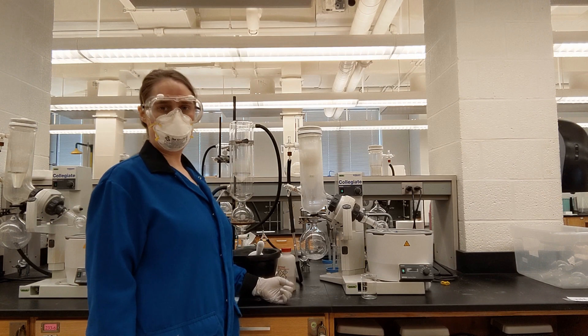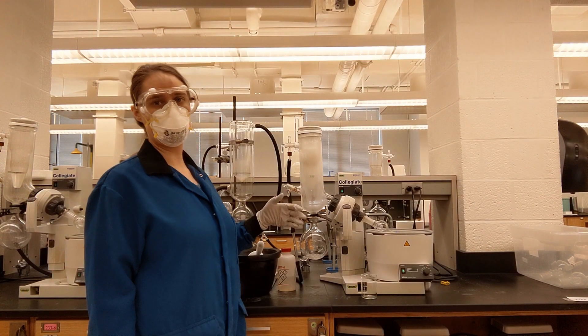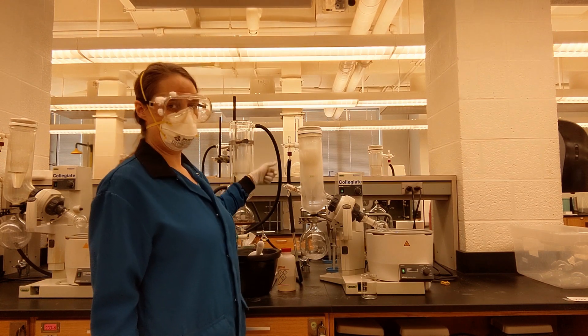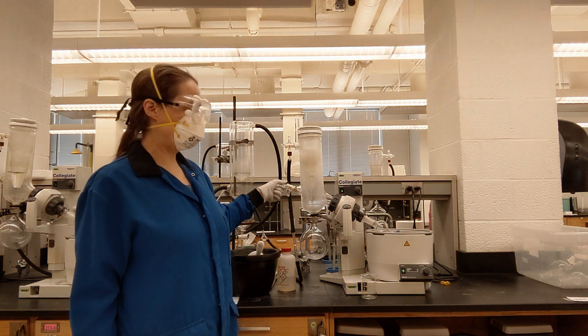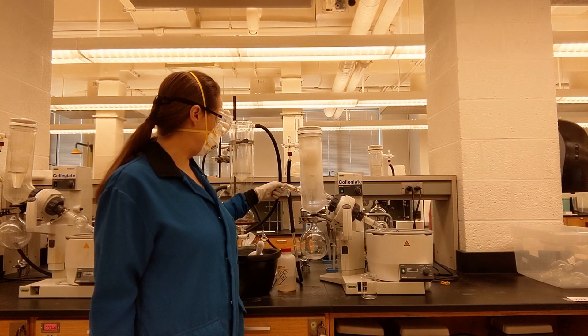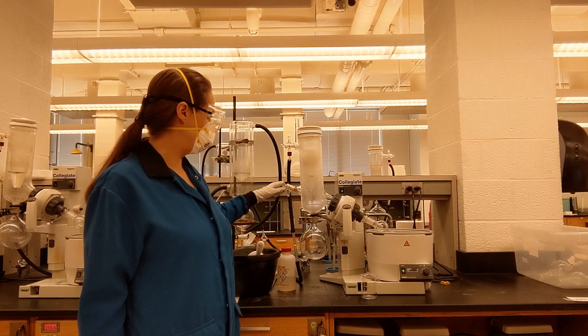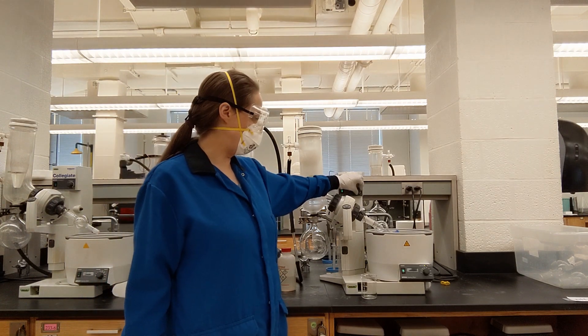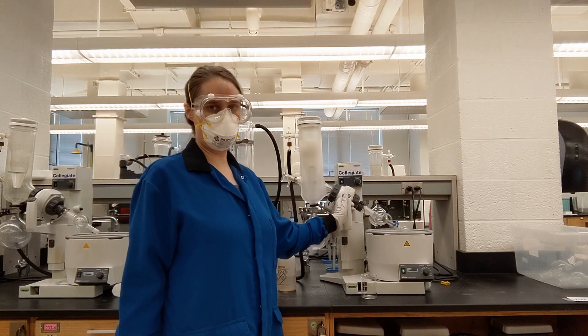Once you're ready to take your sample off, do all of those things that I did to put it on but in reverse. I am no longer applying vacuum. I need to allow air from the room to get in to stop the vacuum. I need to stop the rotation and lift the sample up.